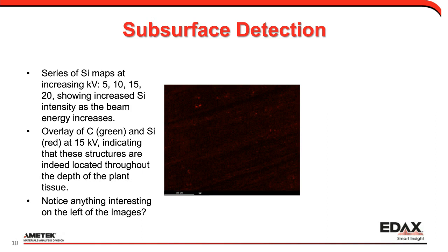Here is an image of the silicon, and the first image is just at 5 kV. Now I'll move it up to 10 kV. And you can see what happens: we now see the silicon X-ray map showing the dumbbell-shaped silicon. So the bright areas that we saw in the electron image are now confirmed as silicon X-ray signal. We could move it up to 15 kV with another mouse click, and 20, and we don't get too much more change between 10 and 20 kV.